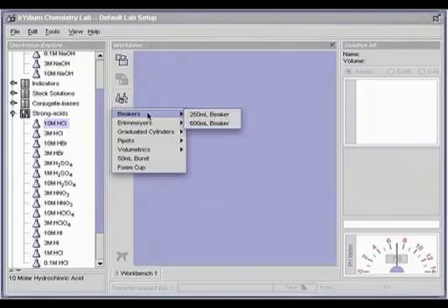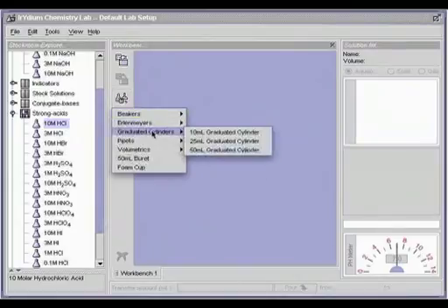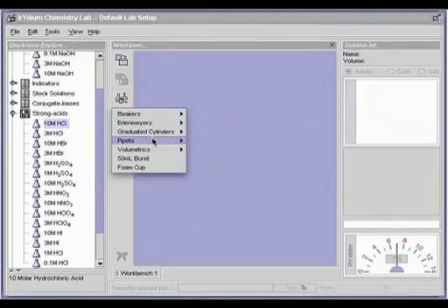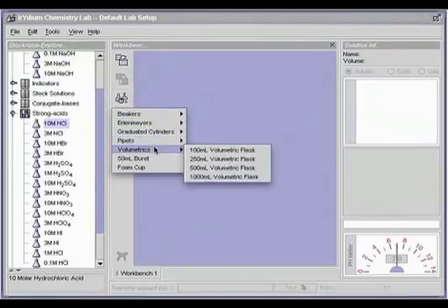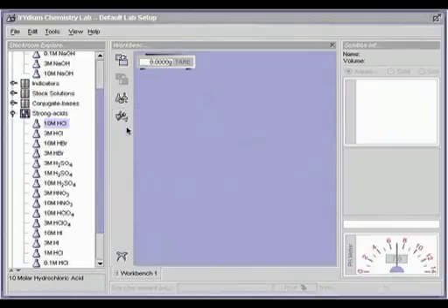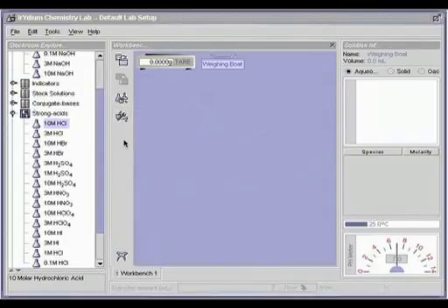You can use the glassware menu on the action bar to obtain empty glassware. The virtual lab also has a scale, weighing boat, and Bunsen burner.